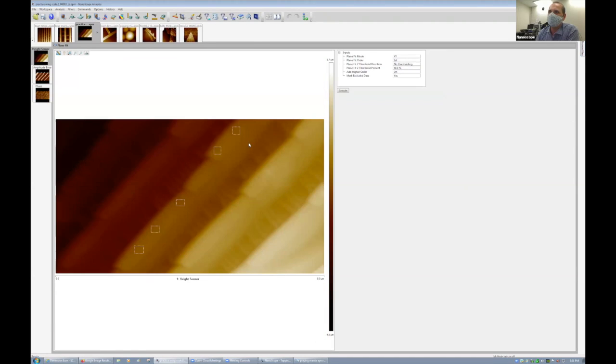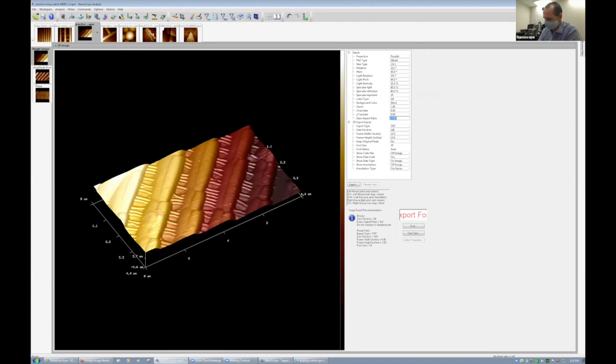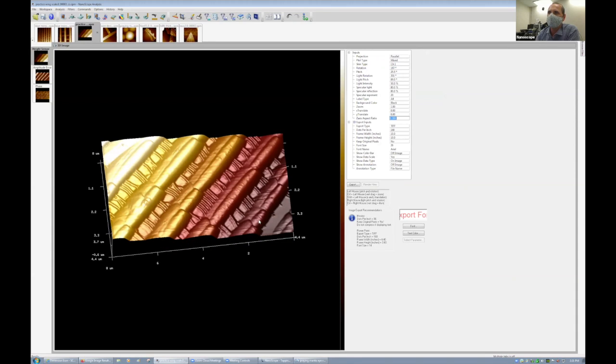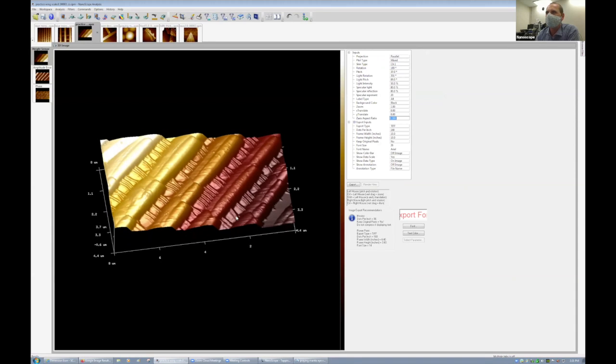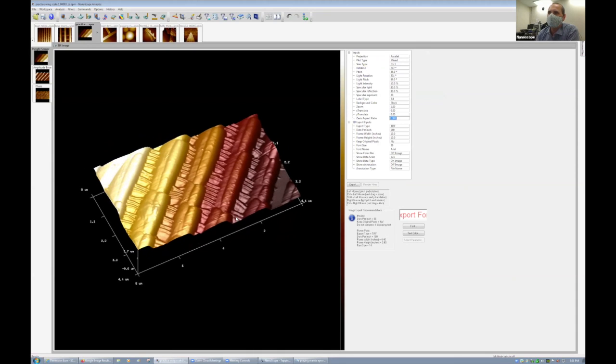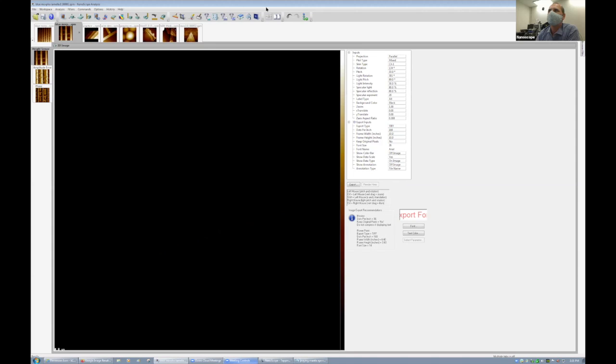And these are the scales of yet another butterfly. This is not the blue Morpho. We don't know what it is. It was called a practice wing. But it has a completely different structure, with a lot of little connections which are irregular, and very long rounded scales on top. Marcin, can you put the one that we took the other day side by side so they can have an idea?